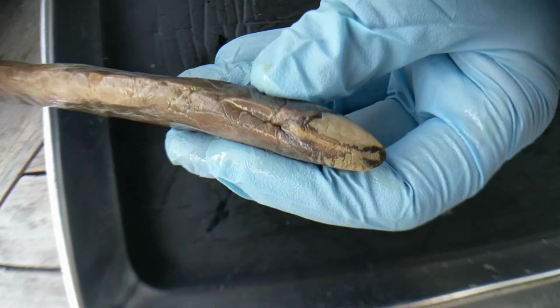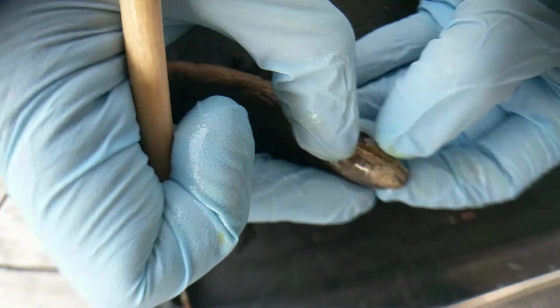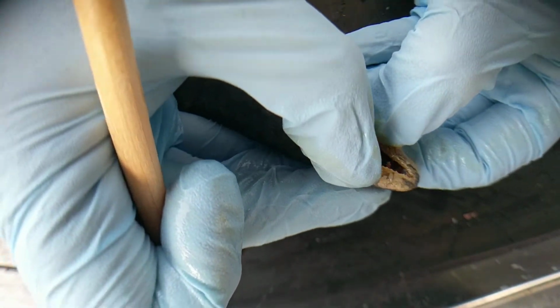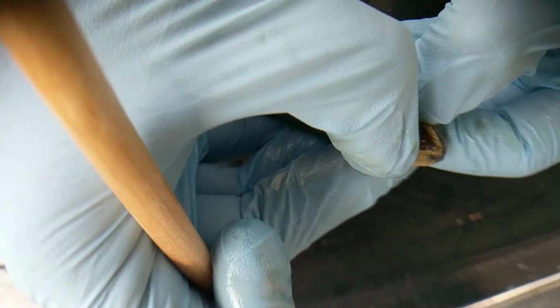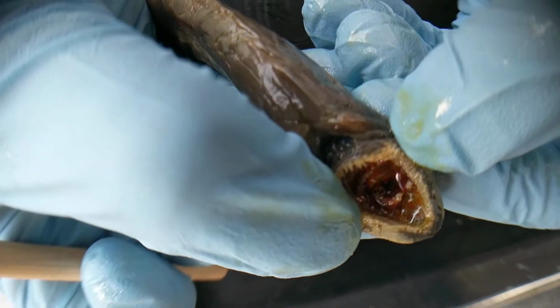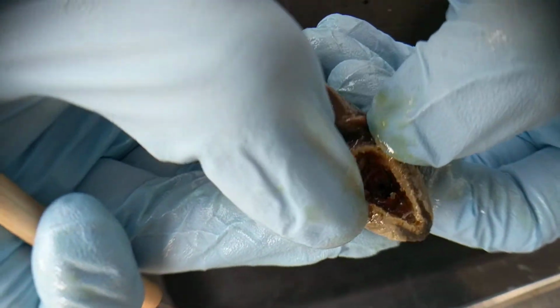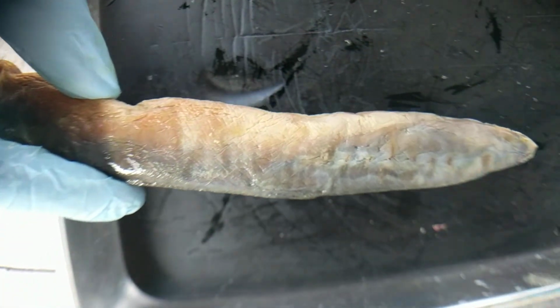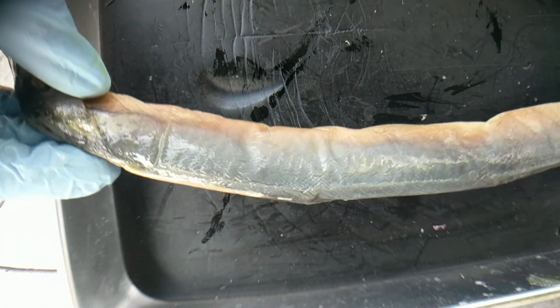Now let's turn it. This one's been a little bit compressed and flattened, but if we open up his mouth, remember now they don't have a lower jaw, so it's just the opening of the mouth like that. Let me loosen it up a little. There we go. Okay, so now you can see what the mouth looks like. It's sort of like just having the upper jaw, and they have adapted to be blood-sucking on other marine fishes and freshwater fishes too. So there's different species of lamprey.